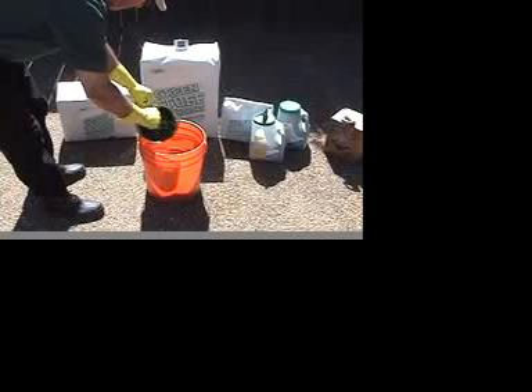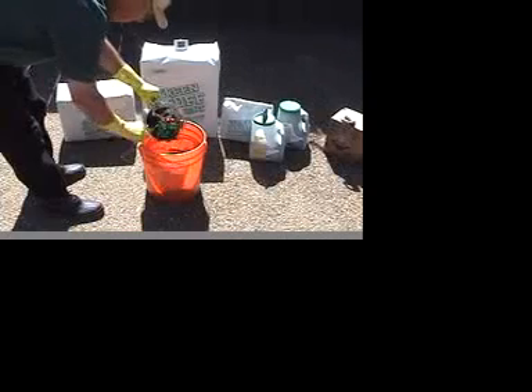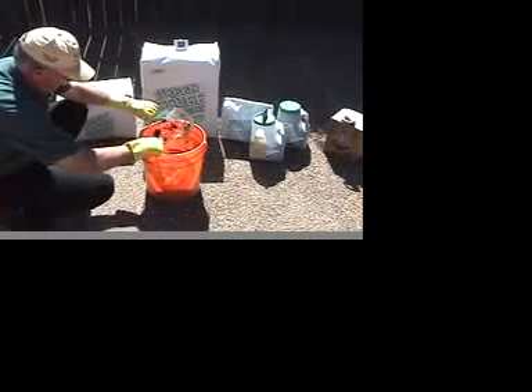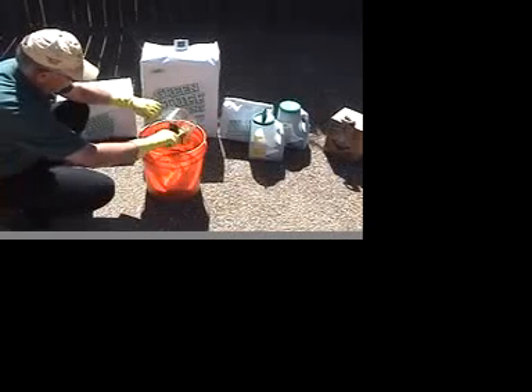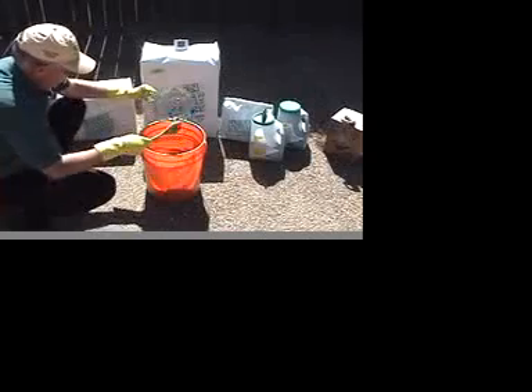This is one half of a pound of GreenStuff absorbing one full quart of battery strength sulfuric acid. We are just under two minutes, and the acid is no more.